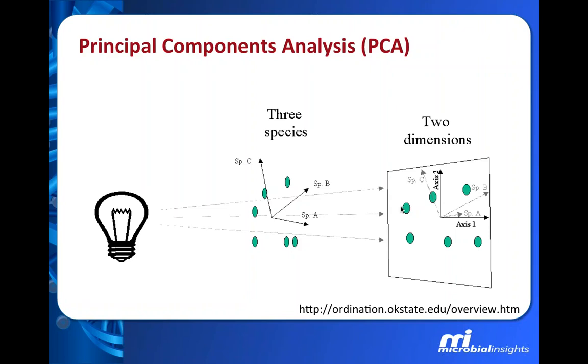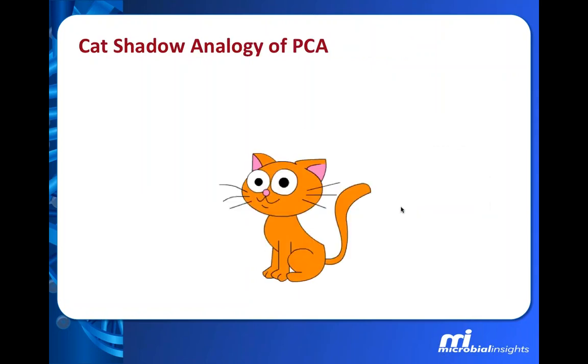So PCA is a technique that we can use to prevent this from happening and help us not be misguided, because it brings out the biggest differences and the strongest patterns in our data set. So if you'll bear with me for just a moment, I want to give you a really simple analogy that a colleague of mine shared with me, and I think it's really valuable.